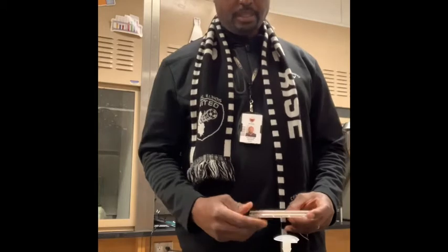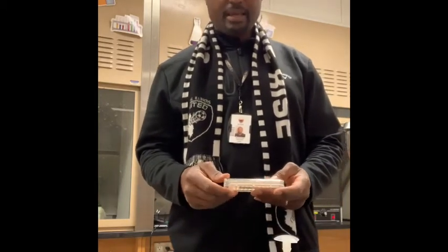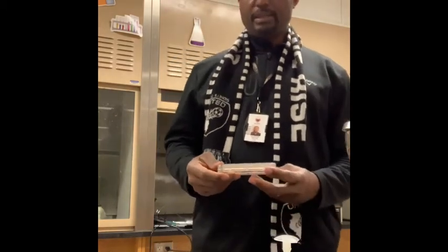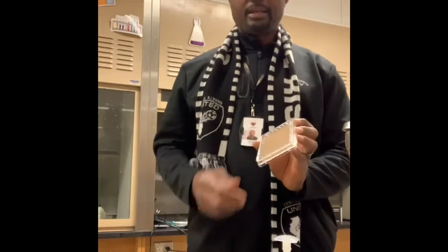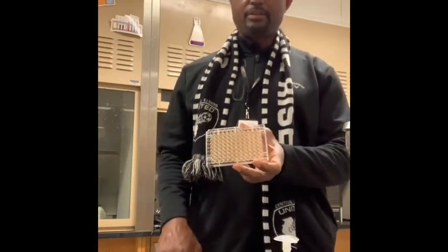And so we buy a plate that is specialized to test E. coli and coliforms. And basically what we do is it comes with 96 wells already with a testing material.